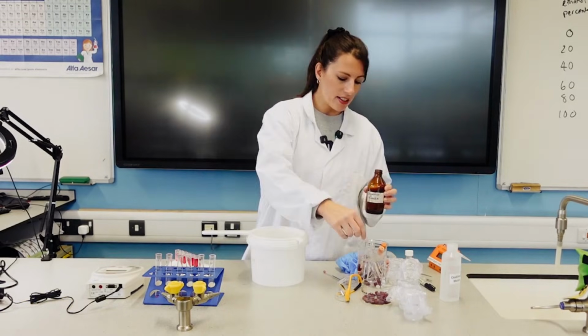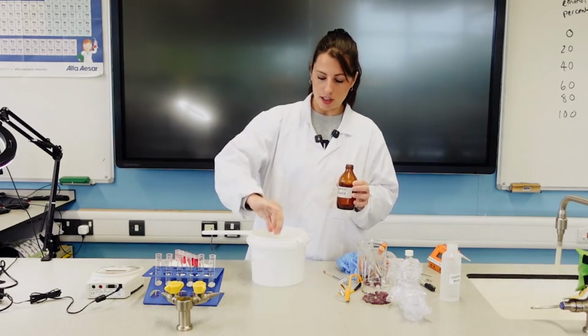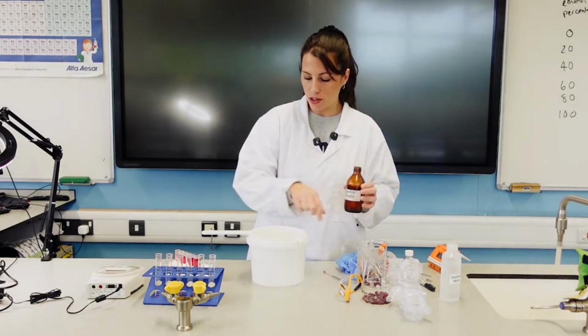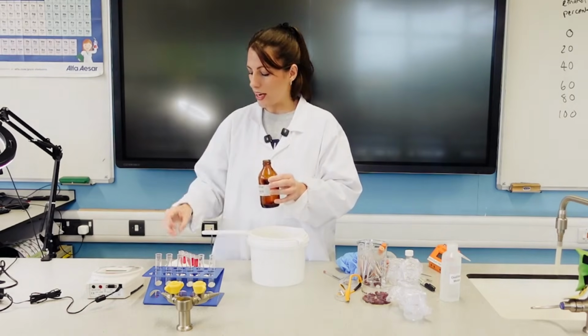And anywhere they've still got the beetroot discs in, you might want to have a waste bucket like this with a sieve over the top. So they can do that, collect all of the beetroot at the end, and then any liquid in there can also be poured into our organic waste bottle.